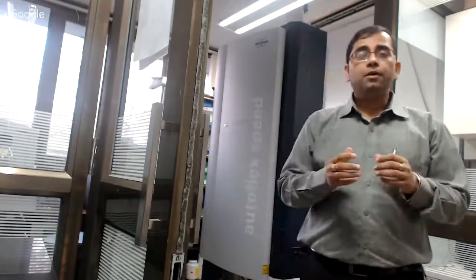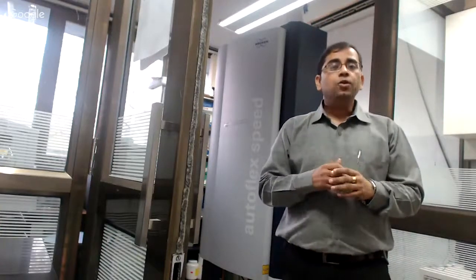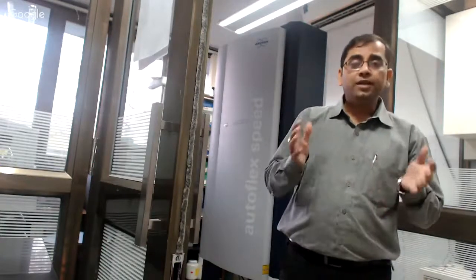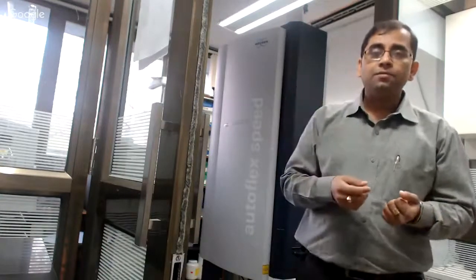Right now mass spectrometry technology is undergoing a lot of revolution and a lot of changes, and you might be hearing that many LC-MS platforms are becoming much more robust for proteomic analysis. But I must say I'm not totally convinced by those statements, because each instrument has its own unique capability and offers certain unique applications which you cannot obtain from other instruments. For example, imagine from 2D electrophoresis or from an SDS-PAGE gel, you have obtained a lot of bands and spots of interest, and you want to identify all of those proteins very quickly.